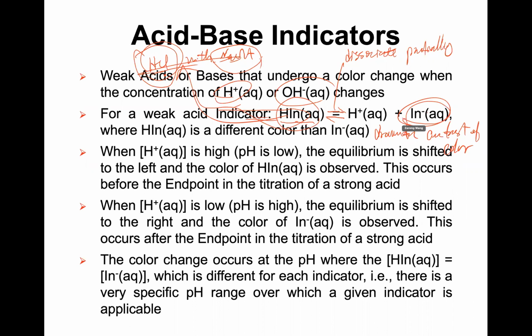That's how, for the indicator, we only need a small amount, but it can give us a very sharp color change. That's the principle for using the indicator, right?